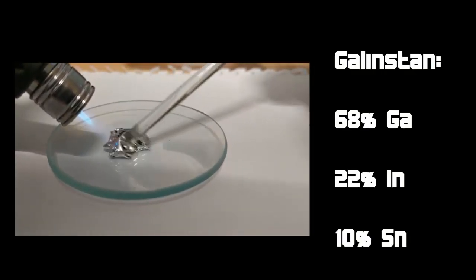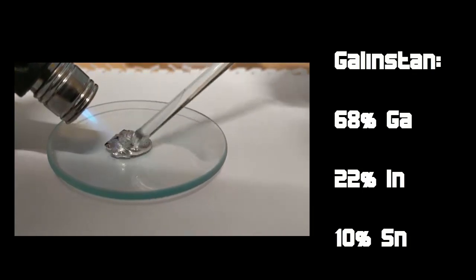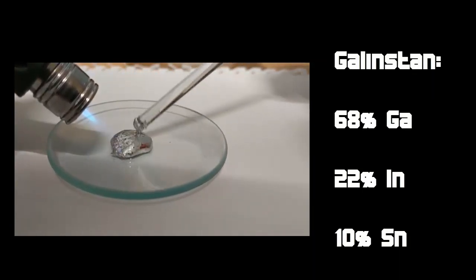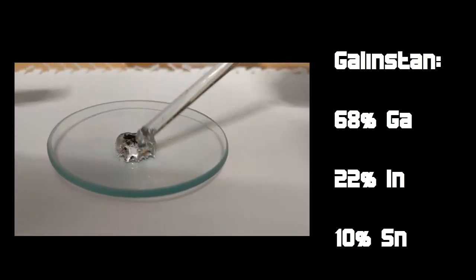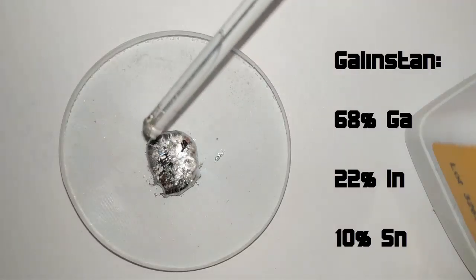Start off by preparing a gallium alloy. This is done by mixing 68% gallium with 22% indium and another 10% tin. Additional heating is required to thoroughly mix things up.